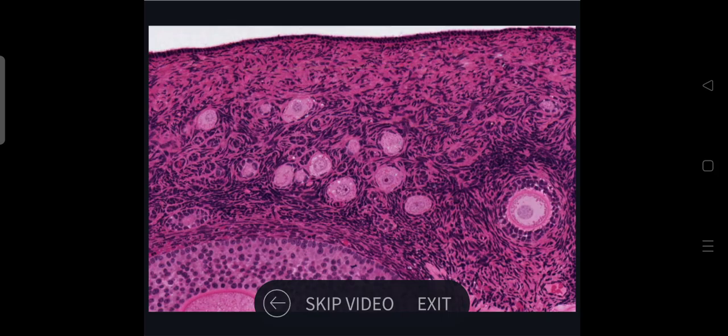Each contains a primary oocyte encased in a single layer of flattened follicular cells and a surrounding membrane. You won't be able to see the surrounding membrane at the resolution of this particular image. The oocyte has a large, round, pale nucleus, a prominent nucleolus, and abundant pale staining cytoplasm containing reddish stained vesicles. These primordial follicles have been present in the ovary since before birth.